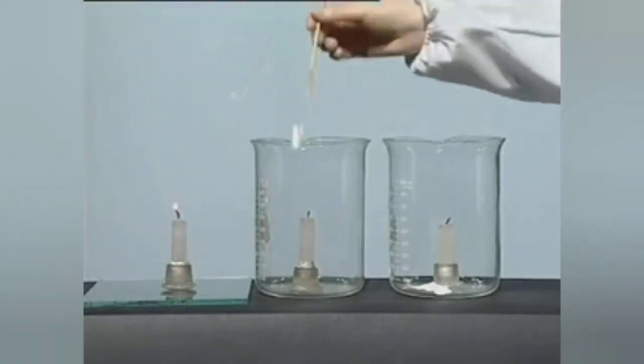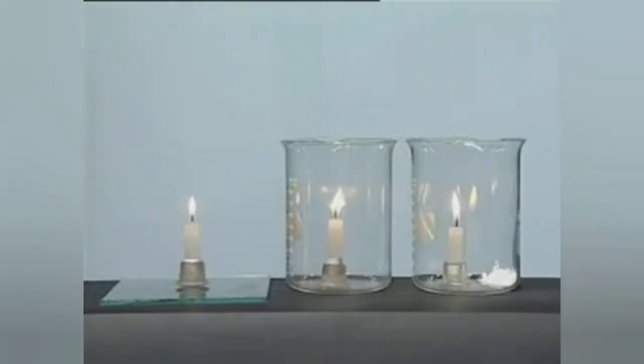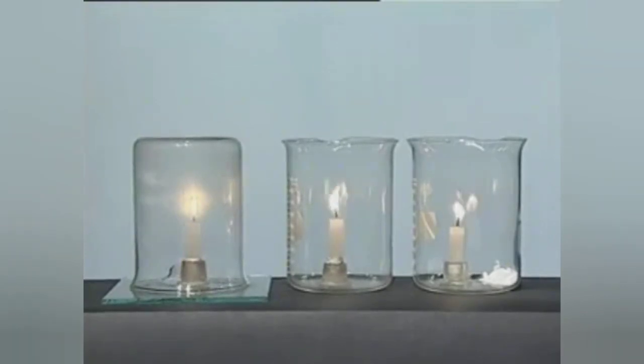Light up the three candles separately. Put a beaker over the burning candle on the glass sheet. Observe that after a period of time, the candle gradually extinguishes.